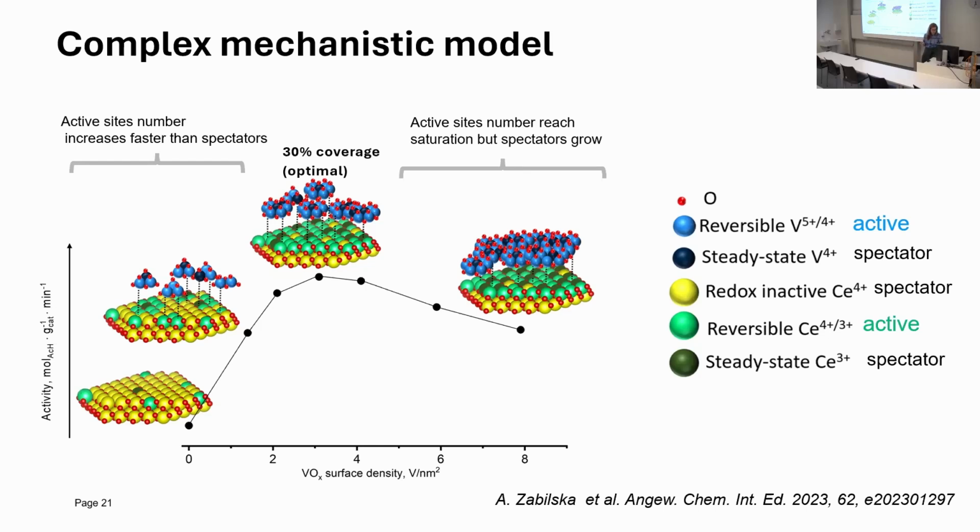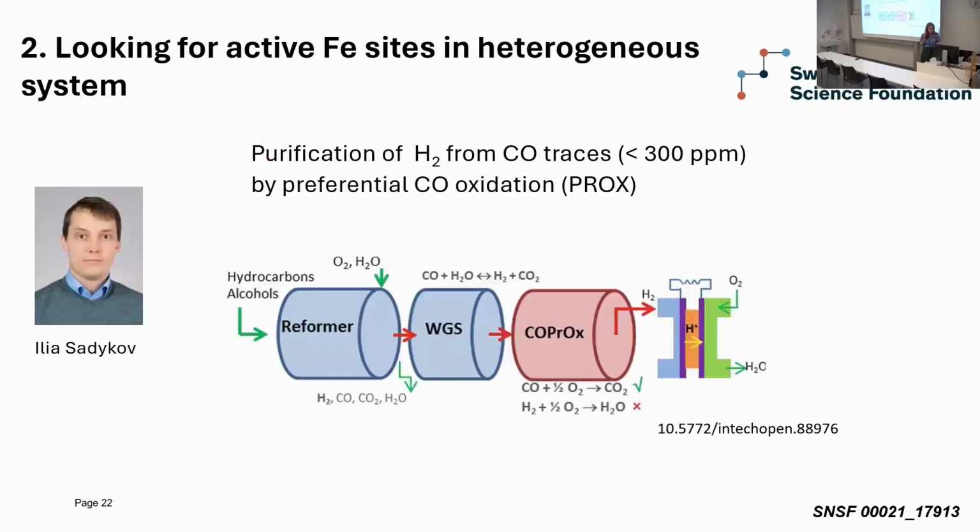So this is the beauty of X-ray absorption spectroscopy, looking ultimately at the structure of the reactive site. But this is not the only possibility of this method. In the second example, I will show you another type of structure-activity correlation.